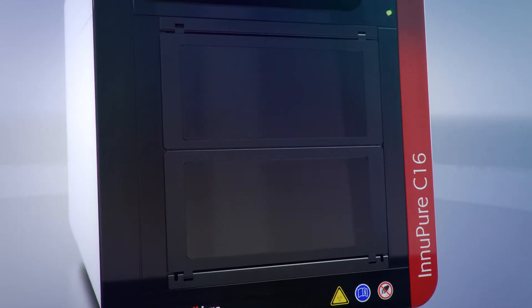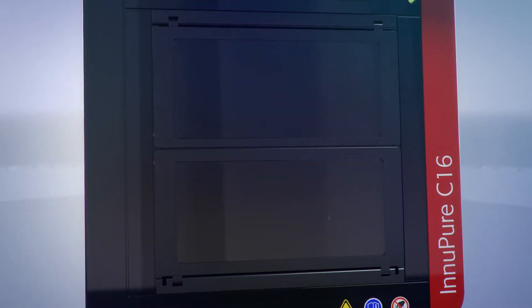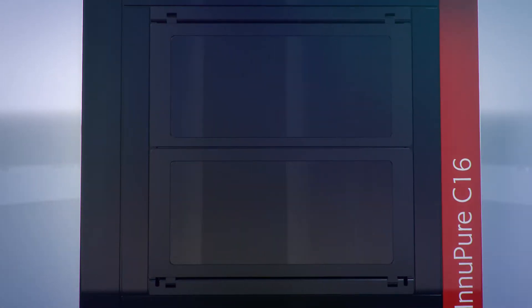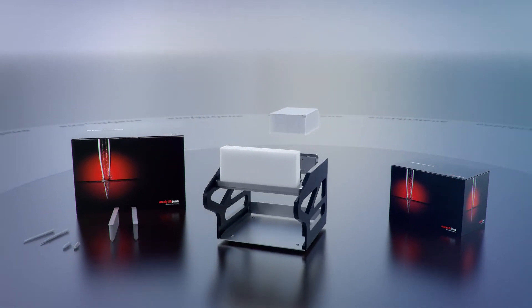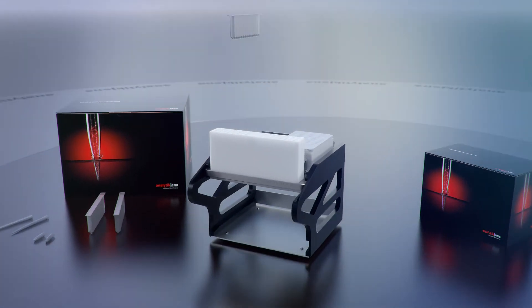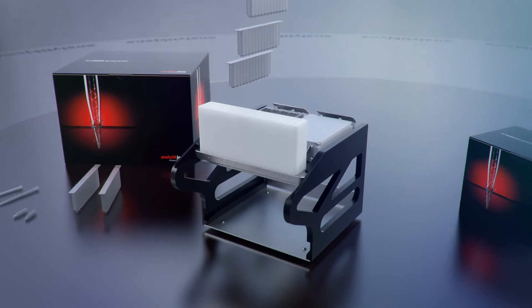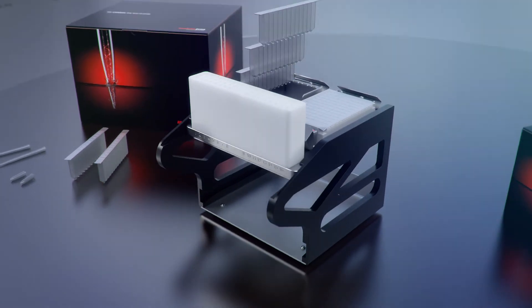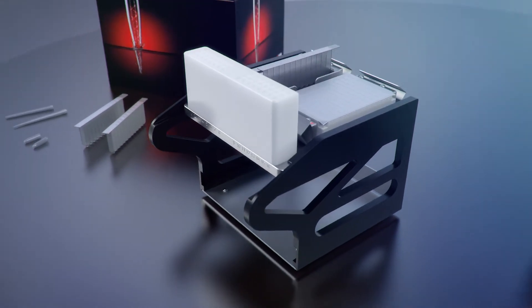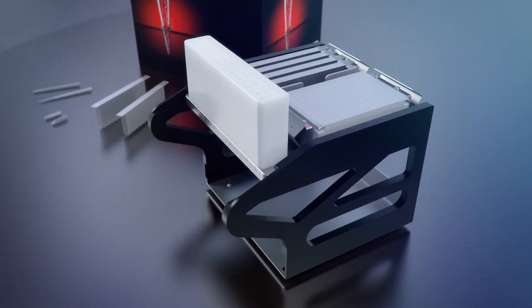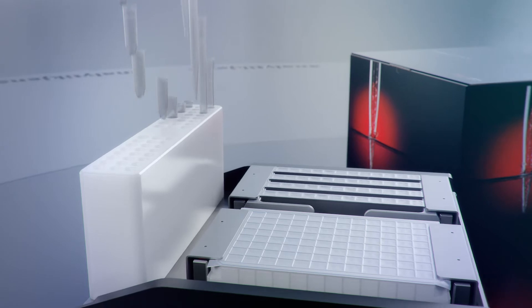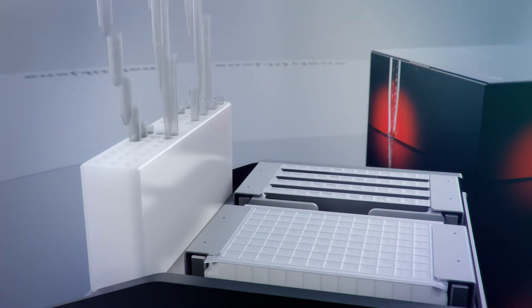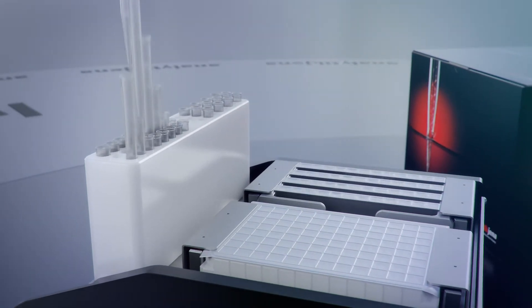The intelligent sample tray concept allows operators to process a variety of reagent plastics in parallel. Users can choose from pre-filled sealed reagent plates and strips for processing samples individually or in groups of up to 16 at a time.